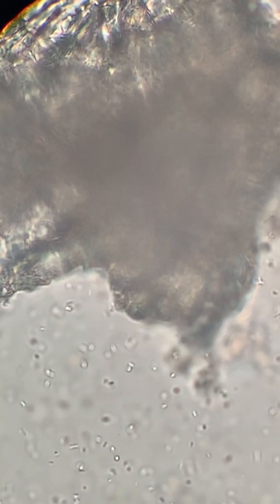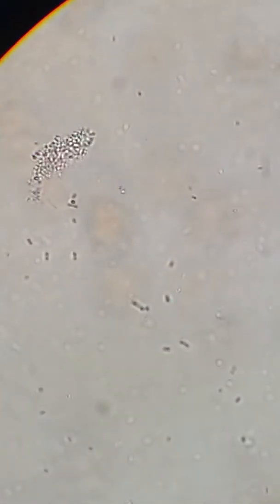And I can include a chart of the different bacteria shapes. That's like, in the powdered form, that's probably just like a little bit of the powder, like part of a chunk of the powder that didn't get mixed up well. So I can include a chart that'll show you the different shapes of bacteria, so you can see the rod ones versus the round ones, which ones are which.